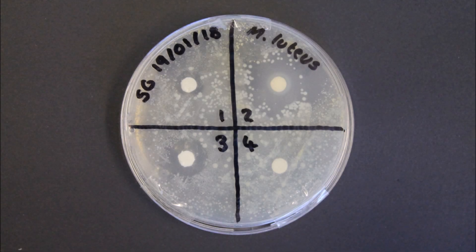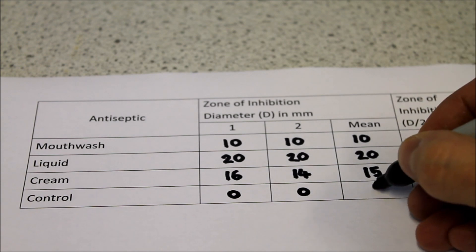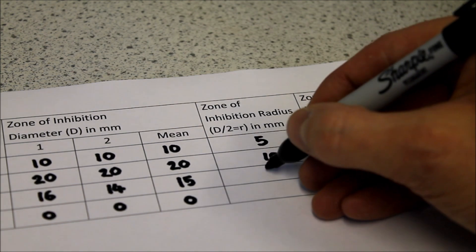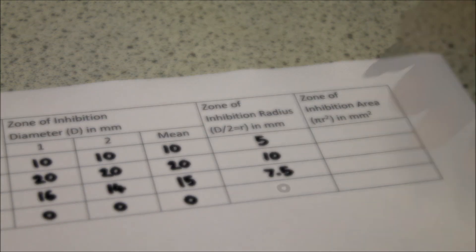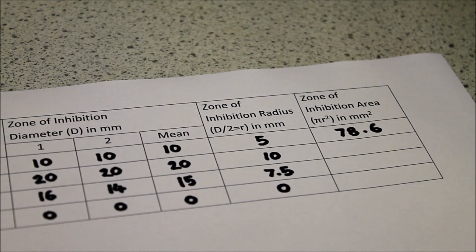The control has not stopped the bacteria growing at all so there is nothing to measure. We then halve the diameter to find the radius and calculate the area of each zone of inhibition using the formula pi r squared.